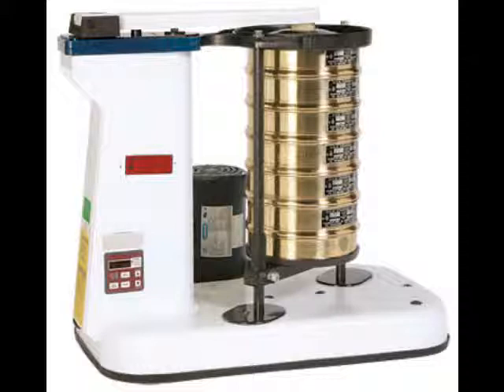So, they've got 20 to 40, 20-70, 30-50, 30-70, 40-70. So, there's a wide variety of sizes that are being sold to these customers. And the question is, do you have enough of those sizes in your sand to make it feasible to sell?